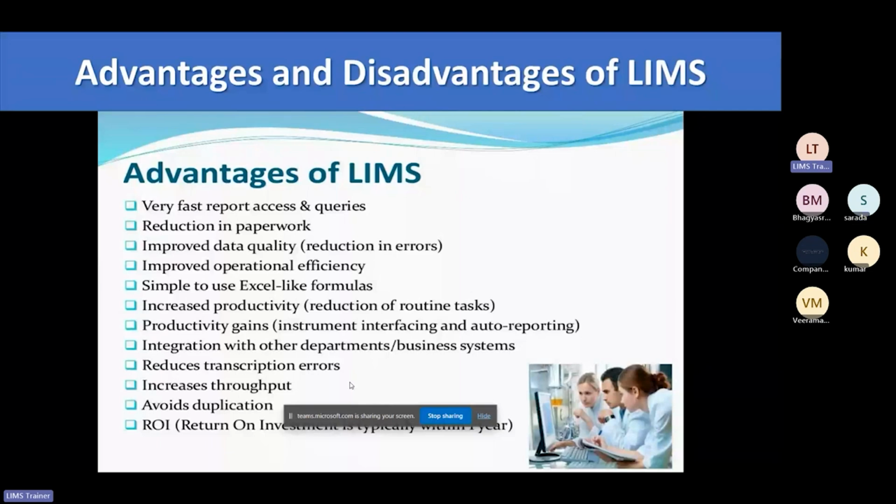Productivity will be increased, and the output will be increased, and the return on investment will be provided within 1 year. Whatever investment that particular laboratory has made on that software, it starts giving results in 1 year only.